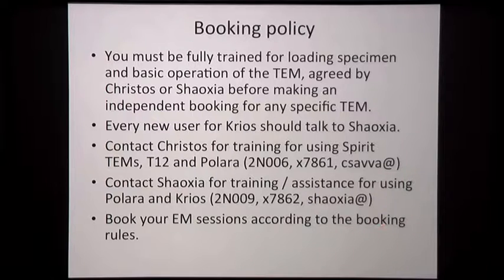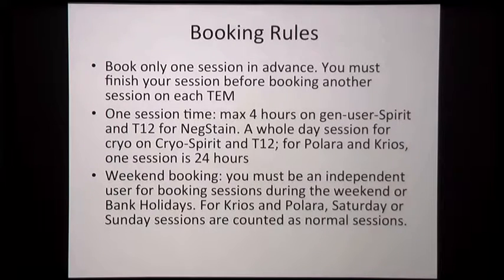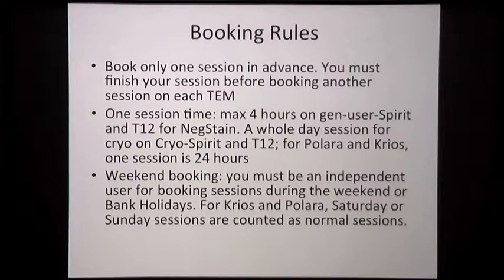Then we have some booking rules, some guidance for booking. This one is you only book 1 session in advance. That means you book a microscope 1 session, but you have to finish this session before you book the other one. Of course, if you go to that day, maybe you start the booking already, but don't book 2 sessions on 1 microscope before, then give people more chance to get in to book it.